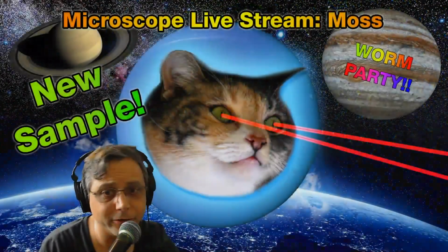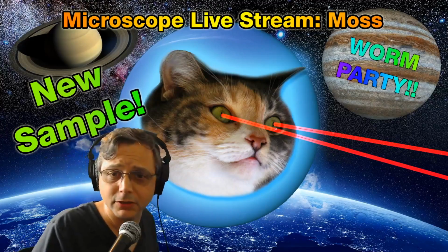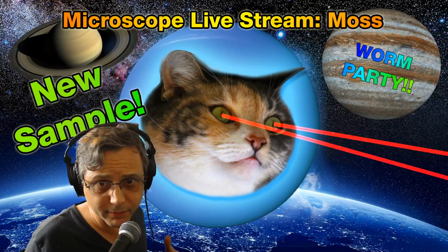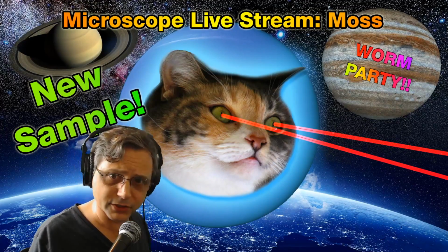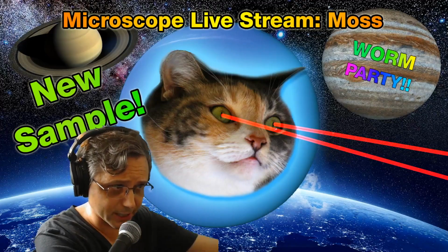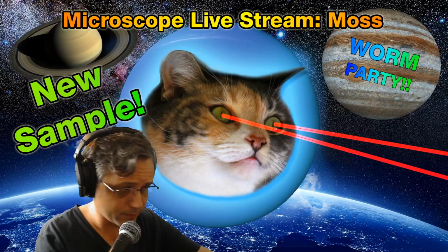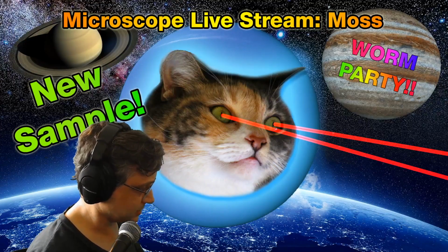Yeah, not a lot in here. Little lumpy guys. Bottom of the drop where the bead is found, but no tardigrades, no worms. Oh, that is quite interesting, actually. Found a lot more life in moss growing on dirt next to my house than I did moss growing on dirt next to a pond. A man-made pond, but the water that I got out of the pond was full of rotifers, just full of them, dominating the space, along with tons of golden algae.